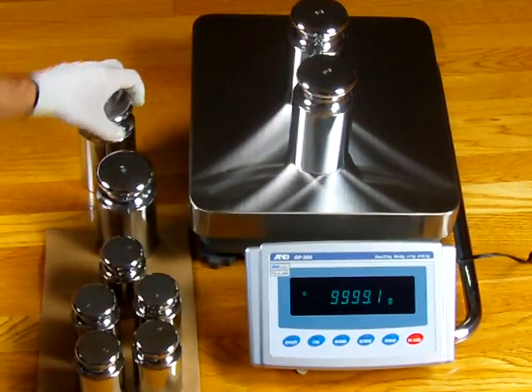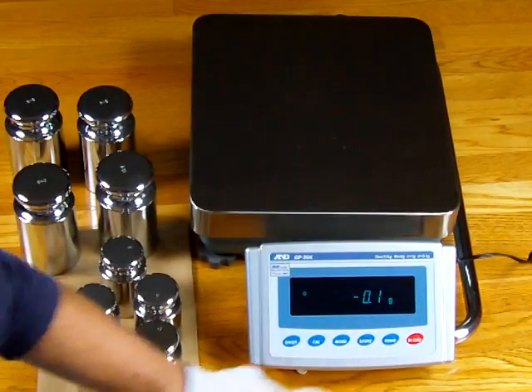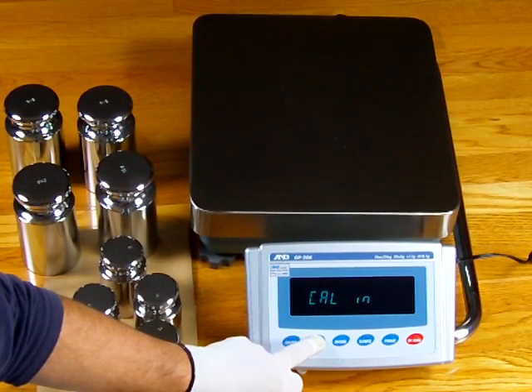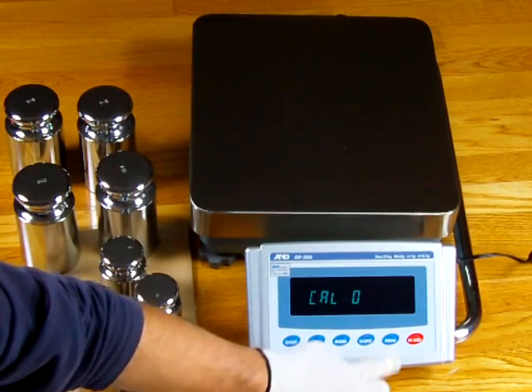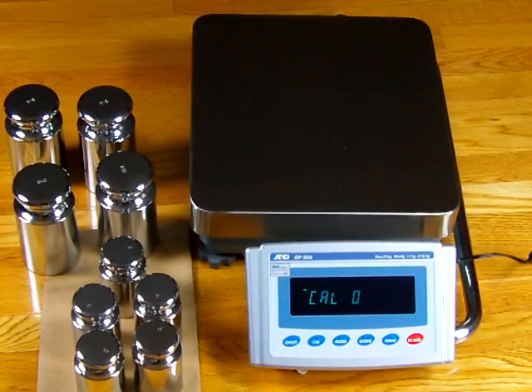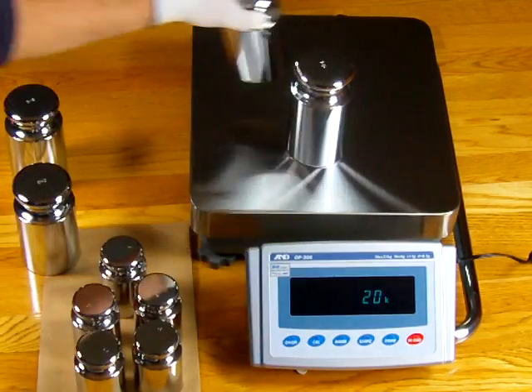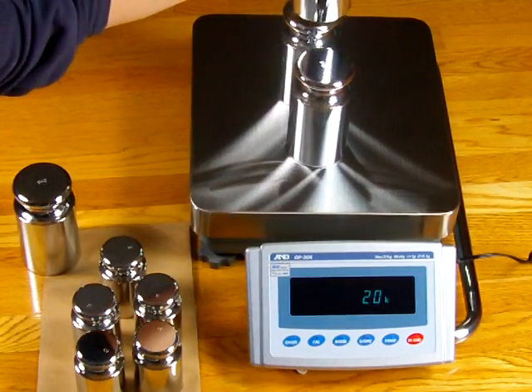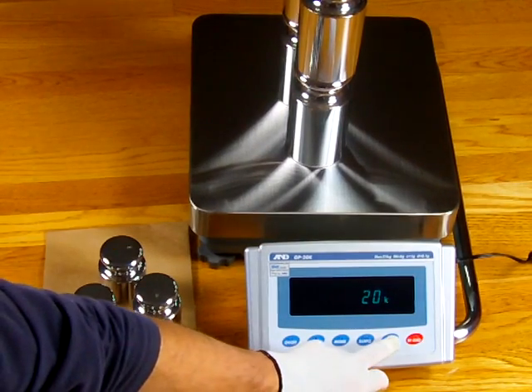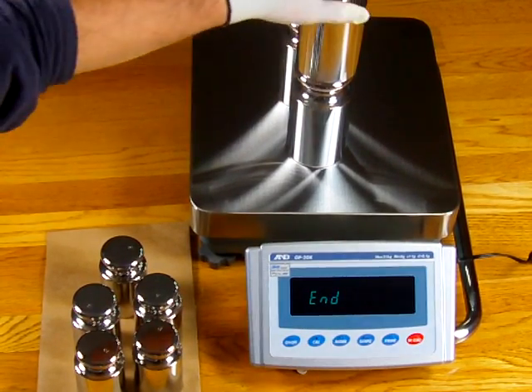We're going to do the external calibration one more time to correct it. Zero the balance, press and hold the CAL key — CAL OUT — and this time we'll do it again with 20 kg. Press the print key to store the parameters. It says 20 kilograms. Put 20 kg on. We have our 20 kilograms on — simply press the print key to store. Remove the weights.